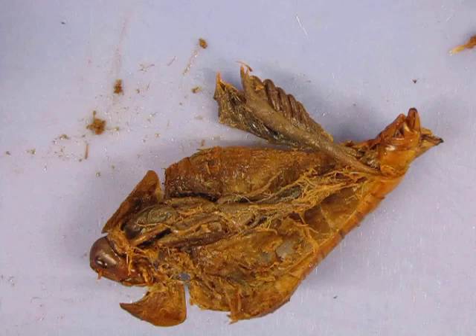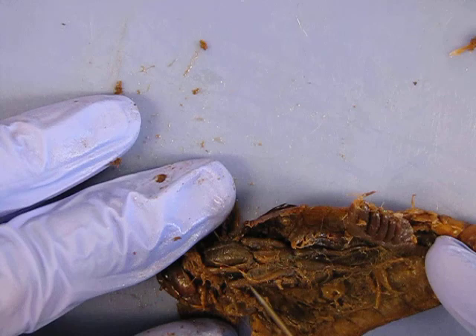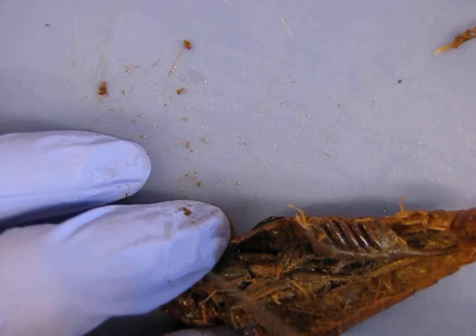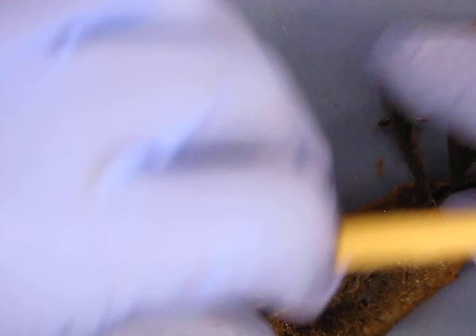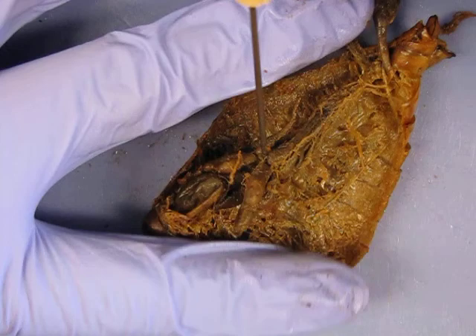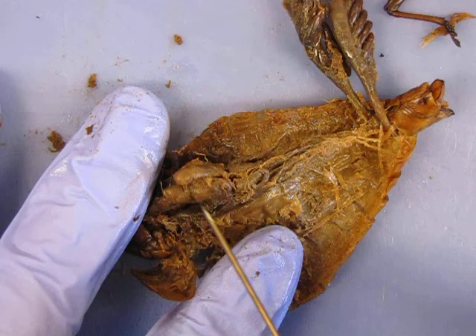As for the digestive system, we've already talked about the external features of the mouth and what each is used for. The mouth will then go back to the esophagus. The esophagus goes to the crop, which is this bigger area here — it is temporary food storage. From there, you want to carefully pull these back but don't destroy them because they're a feature you'll want to look at. Follow the crop to the gizzard — the gizzard is going to be mechanical digestion. You're going to have to move back these gastric ceca, which are these individual projections.